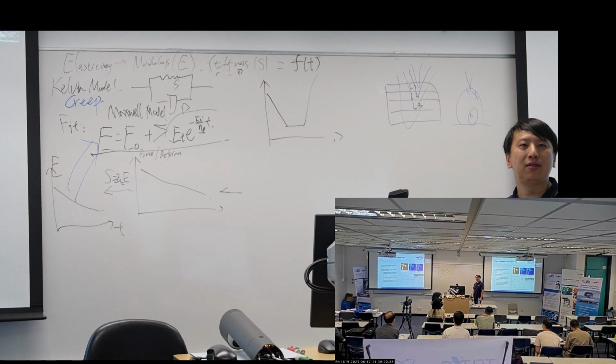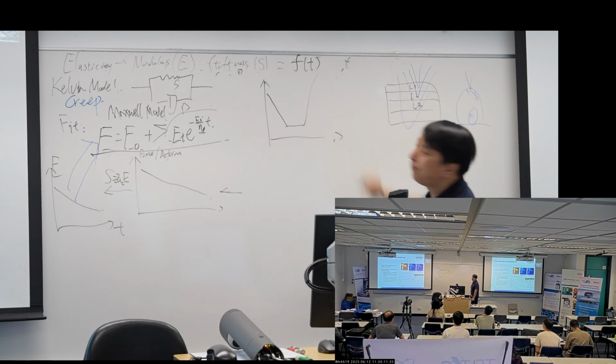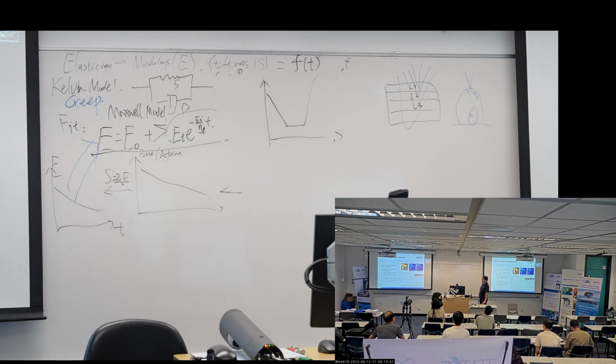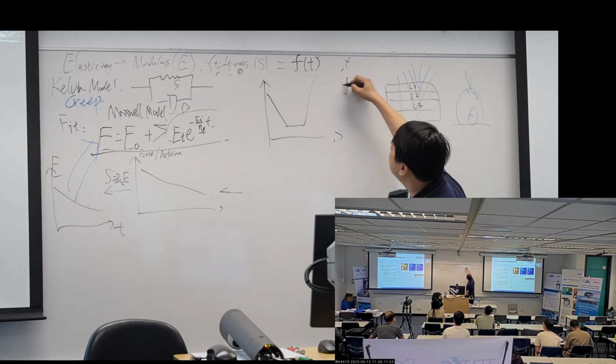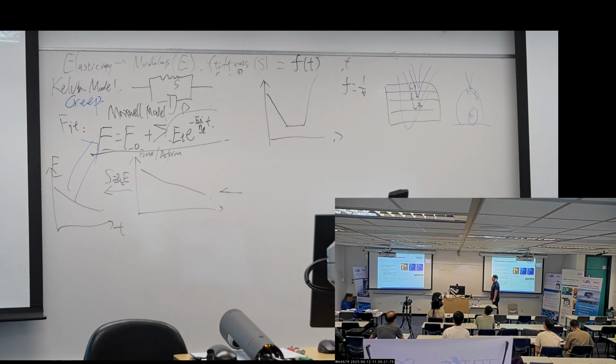So people want to develop another way to do it. In the classic way, they work in time, and in the more advanced way, they work in frequency.